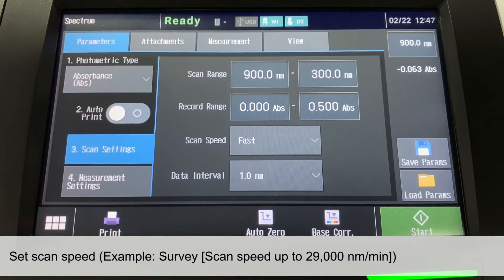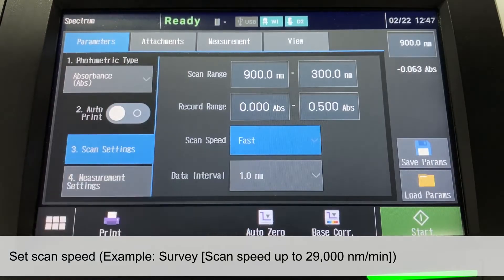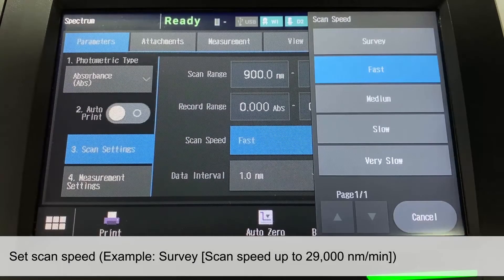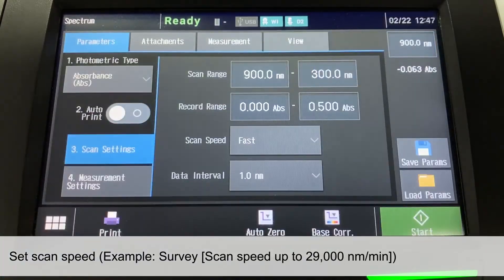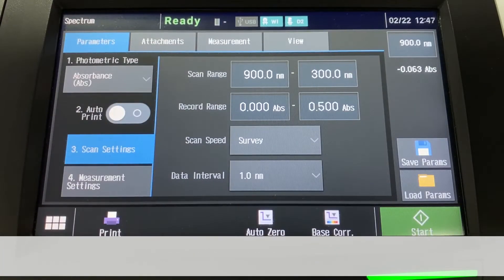Then, we are going to set the wavelength scan speed. For this example, we are going to select Survey, which can perform measurement with speed up to 29,000 nanometers per minute. This means the spectrum scan can be done within a few seconds.